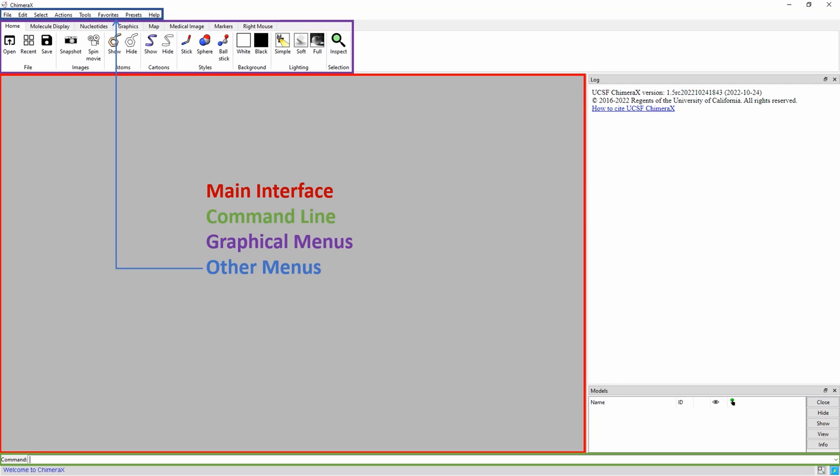There are other menus, highlighted in blue, that have various functions from graphical changes to structural predictions.